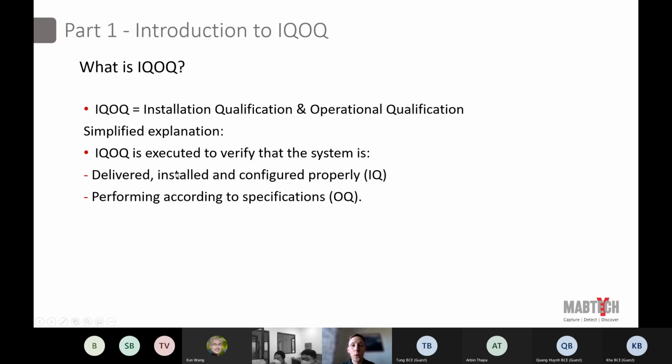Installed is of course setting up all the different cables, and the configuration is basically a little bit what we looked at, making sure that you get correct messages from the software saying that the machine is off or booting and ready and so on.